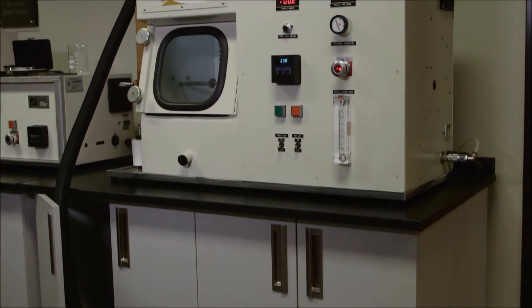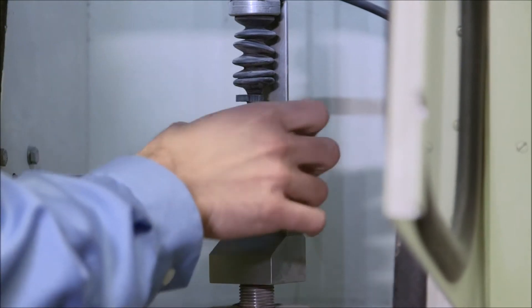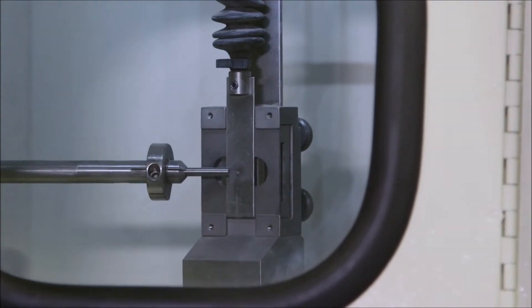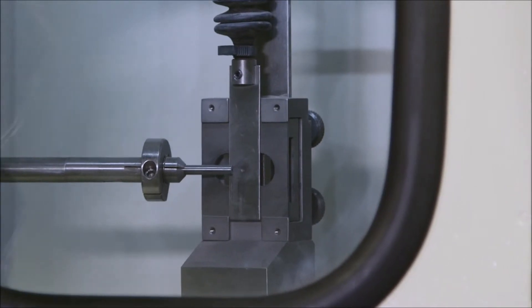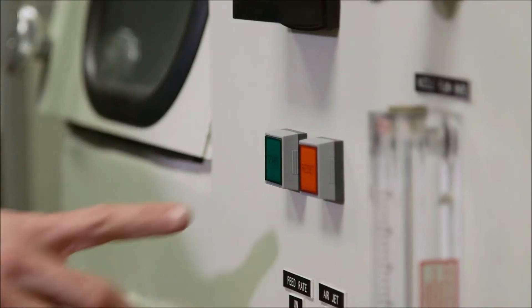We also have an ASTM G76 Erosion Tester, and what this does is look at the erosion wear on a surface. This could be very fine particles that are basically flying through the air, impinging and hitting the surface, and very slowly wearing away the coating or wearing away the surface.